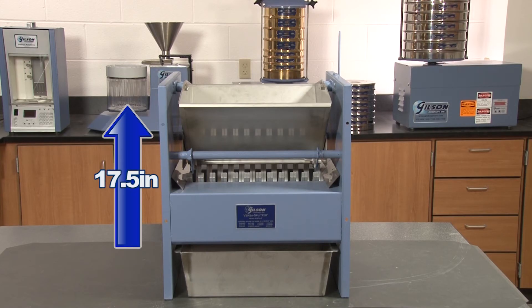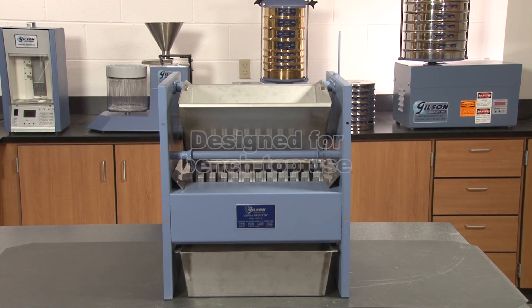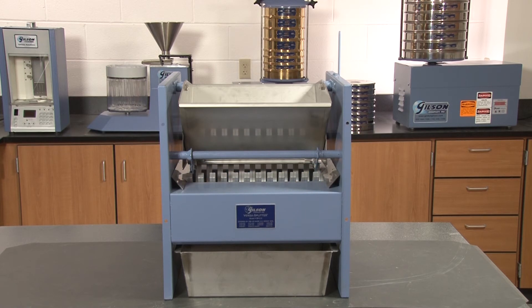At 17.5 inches tall, this accurate and versatile riffle type sample divider is designed for benchtop use and is equally at home in the lab or in the field.